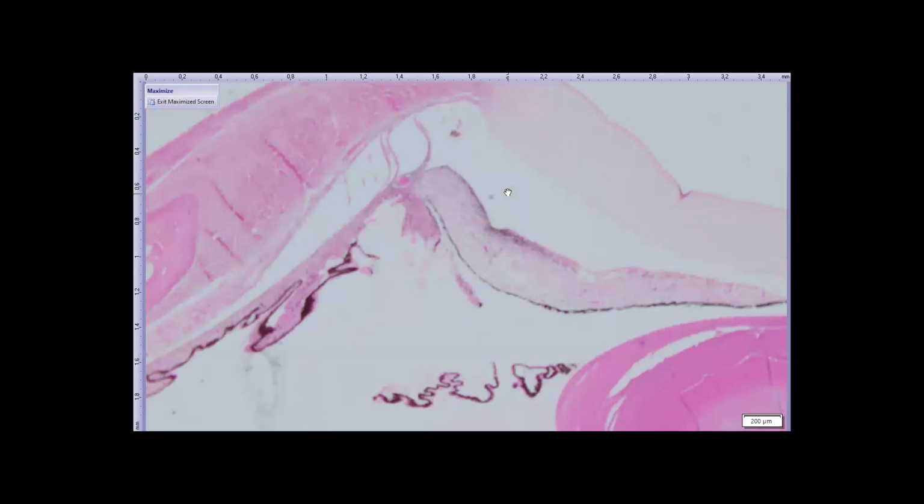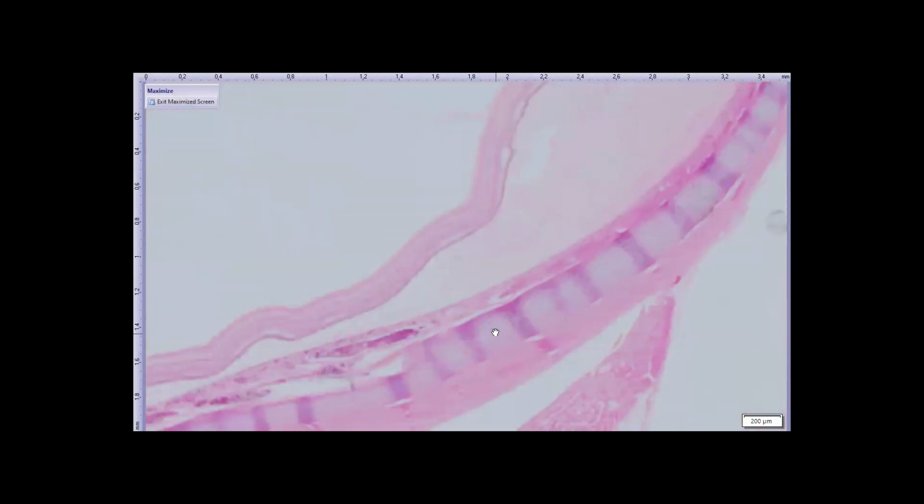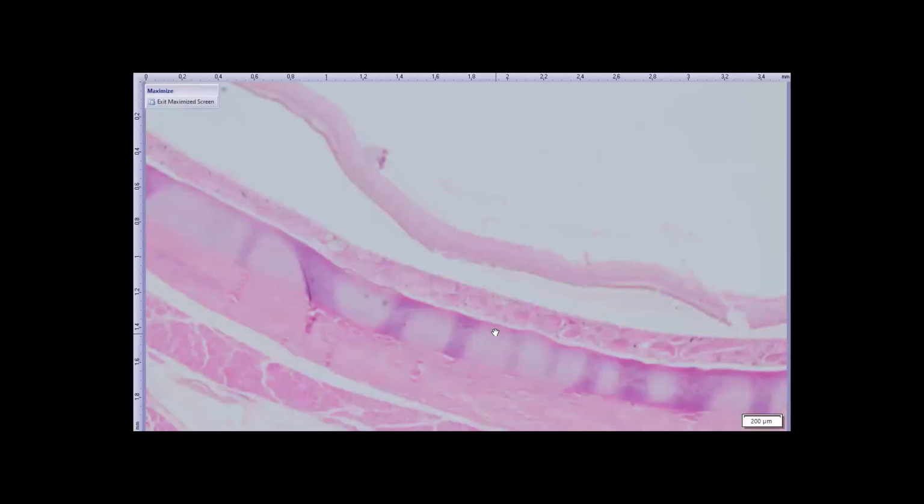Penguins, of course, are the most adapted for vision underwater. All of those birds have lifestyles that would cause them to want to have vision both above and below water. This is the penguin eye. First of all, it has all the features you'd expect in a bird. It has a skeletal muscle, it has a bone, it has cartilage. There's a pecten, even though it's not sampled here.